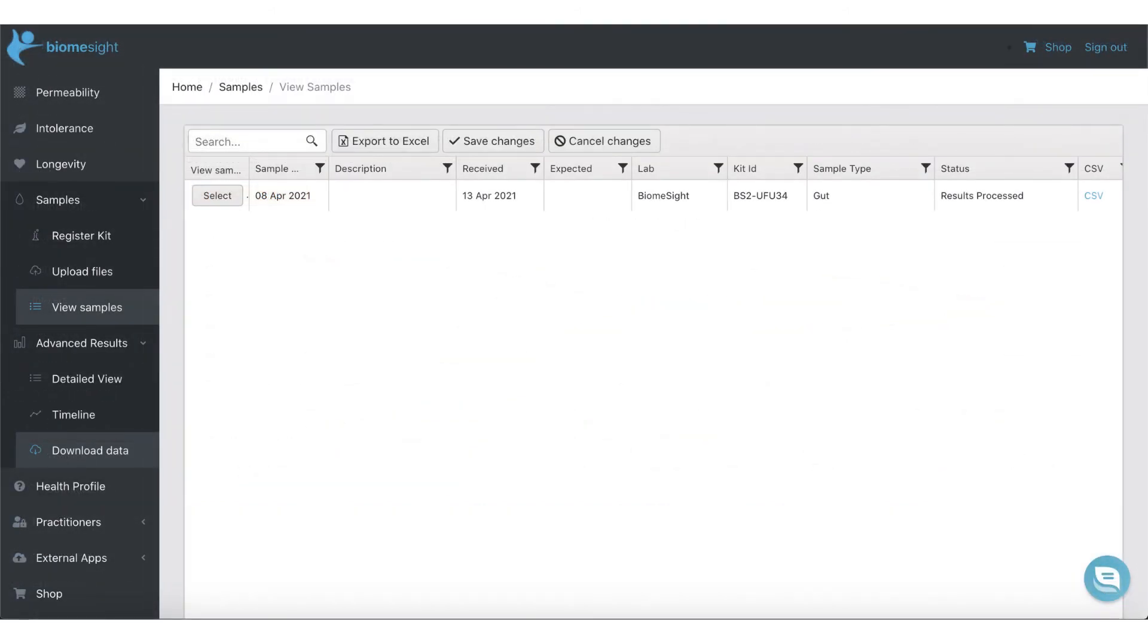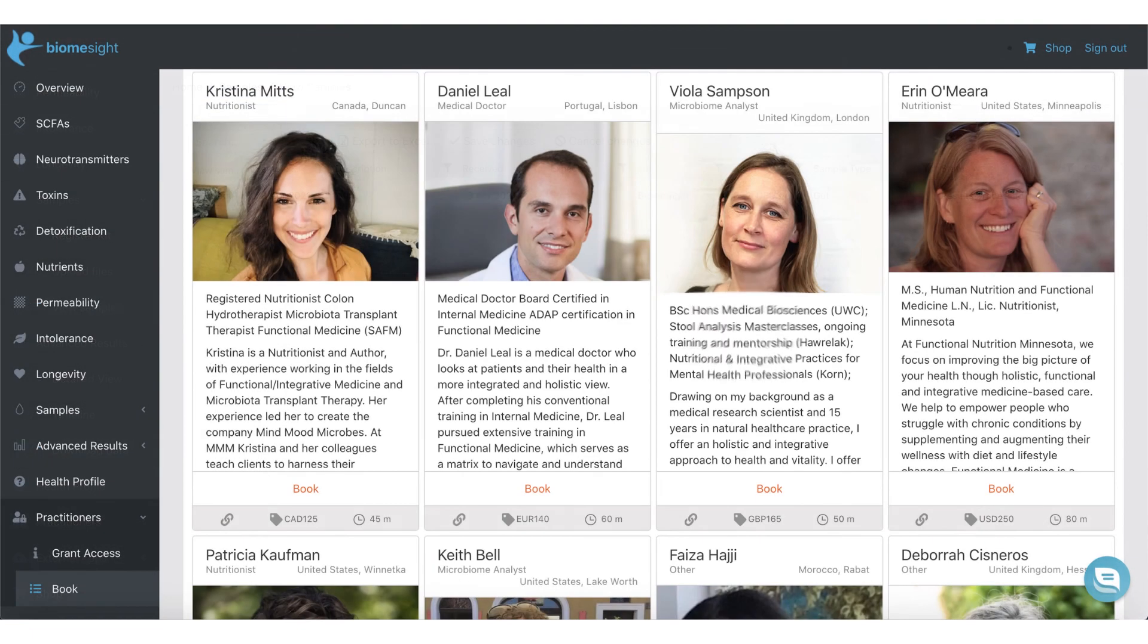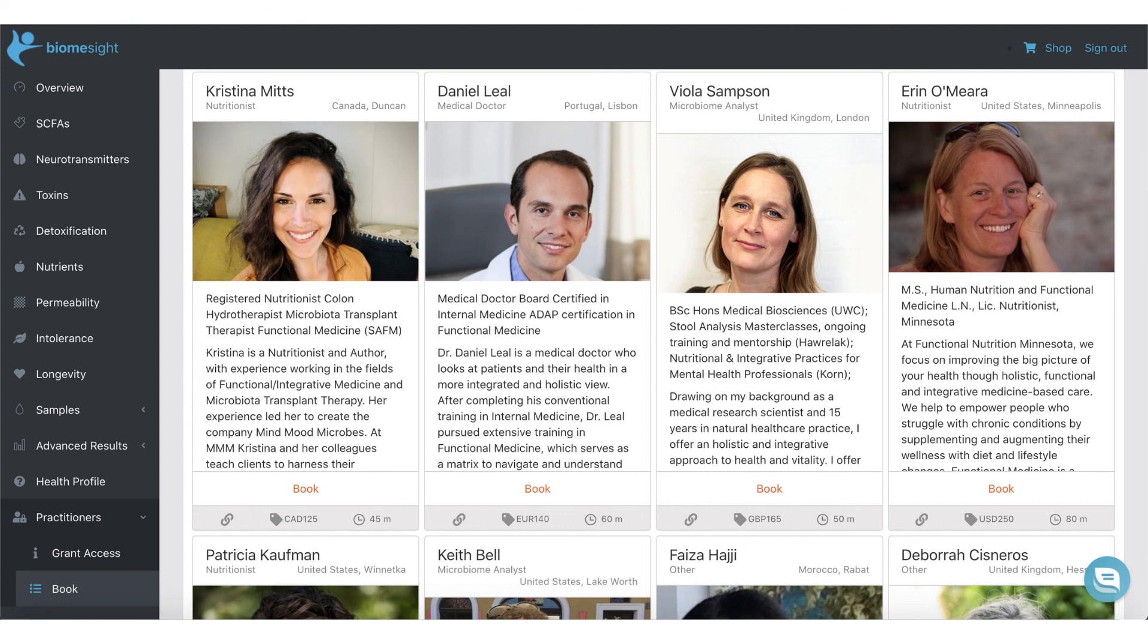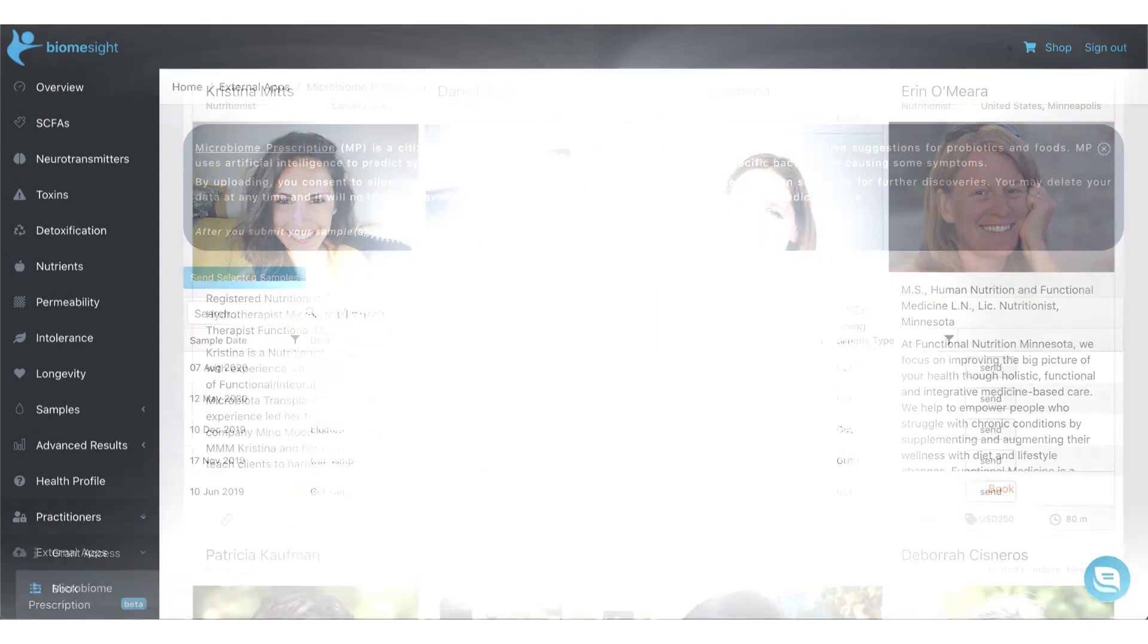You can also download your data to Excel, raw sequence data, as well as a PDF suitable for printing. If you need help interpreting your results and compiling a diet and supplement plan, you can also book and work with one of our partner practitioners and share your profile and results directly from within BiomeSight.